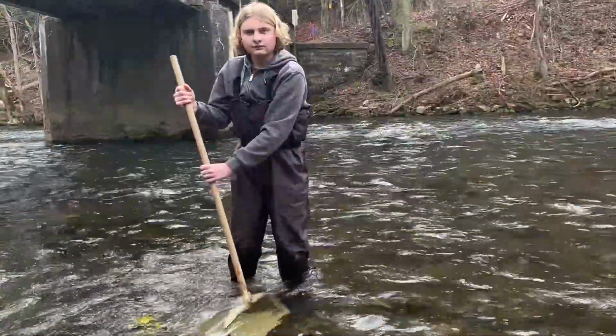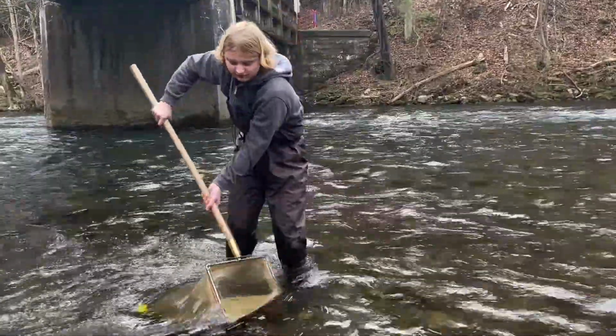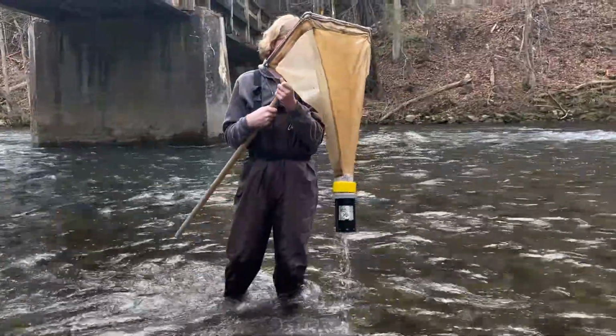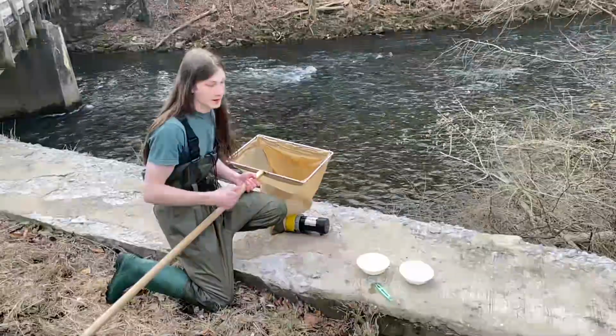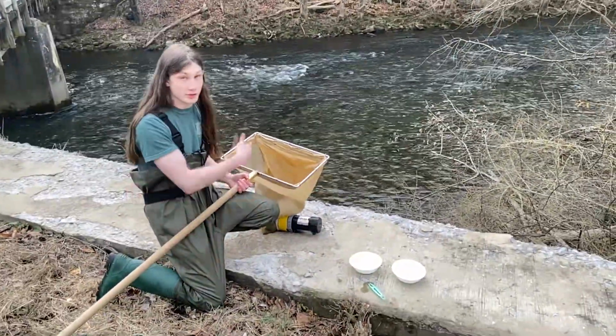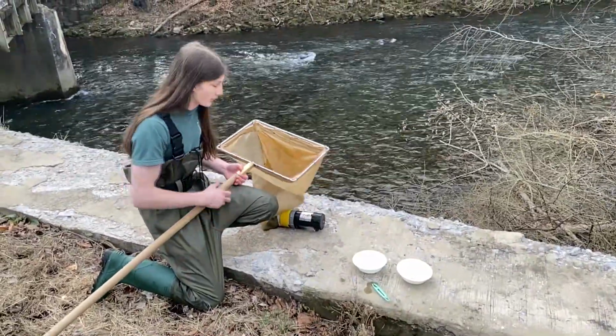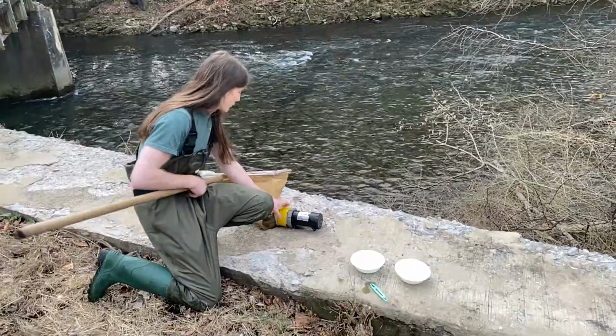Once you've finished kicking, the next step is to lift up the net and take it to where you will be sampling the benthic macroinvertebrates. Now what you're going to do, once you've kicked in the stream, is to collect your benthic macroinvertebrates. Now, in order to do this, you're going to want to invert your net.